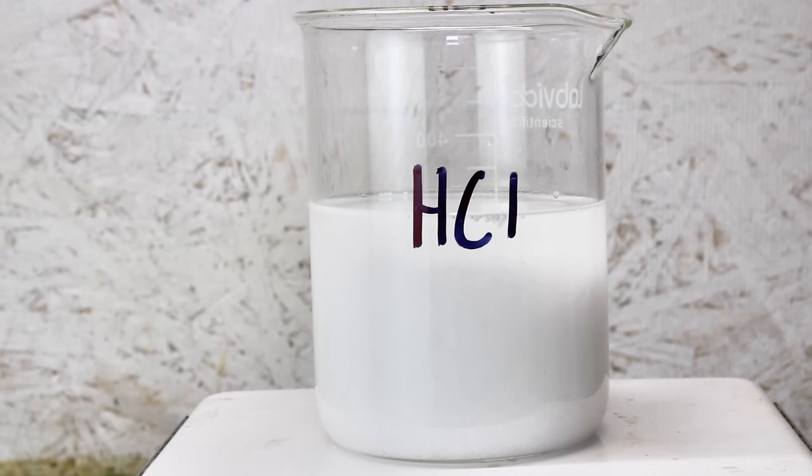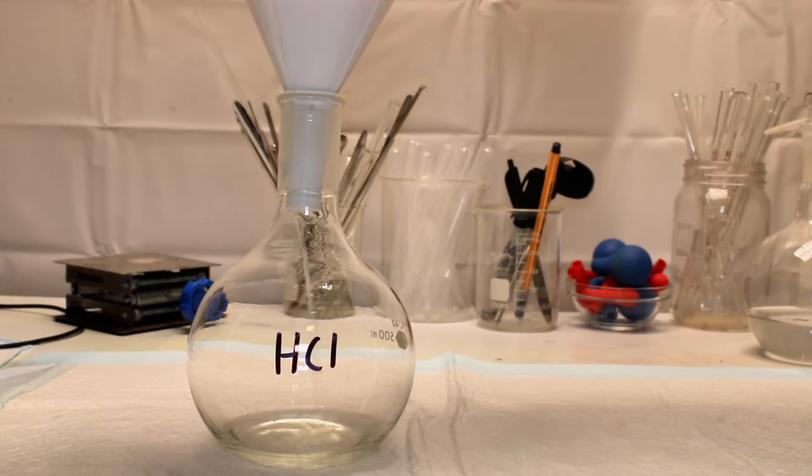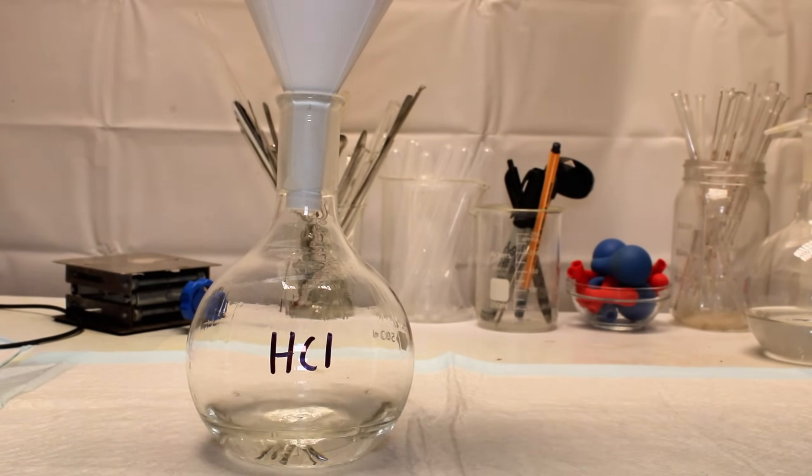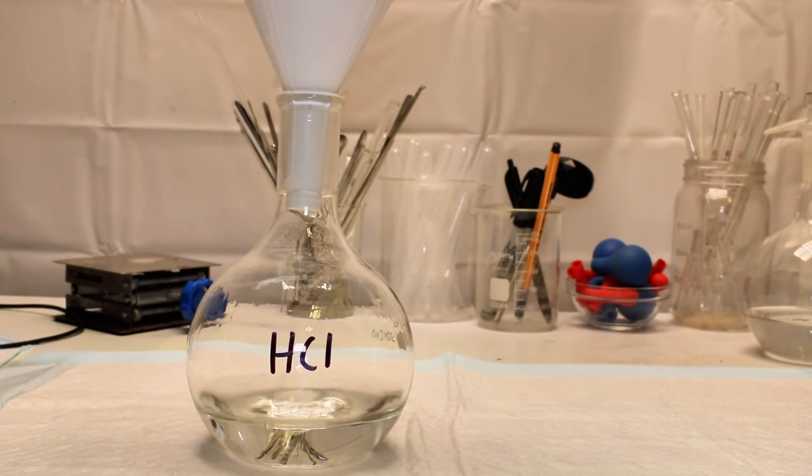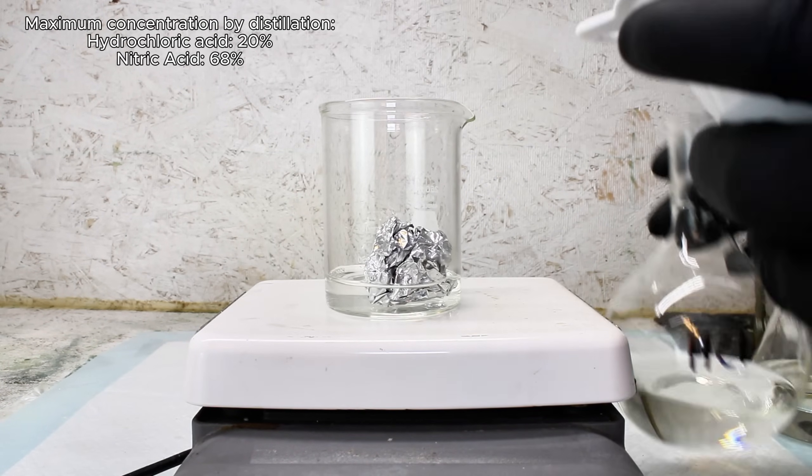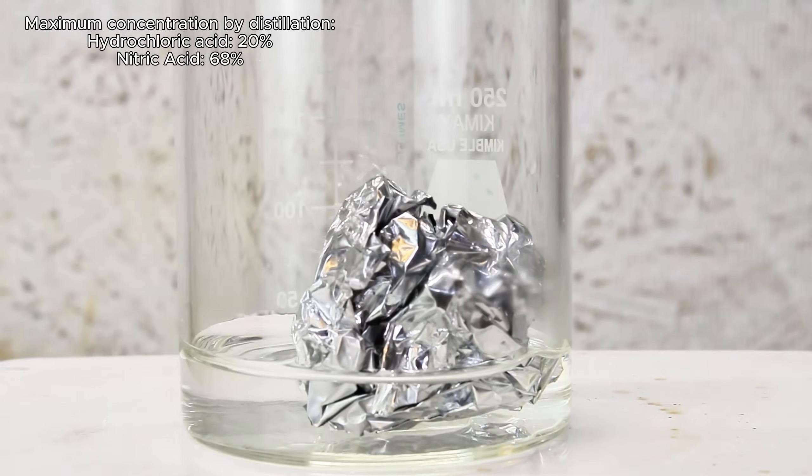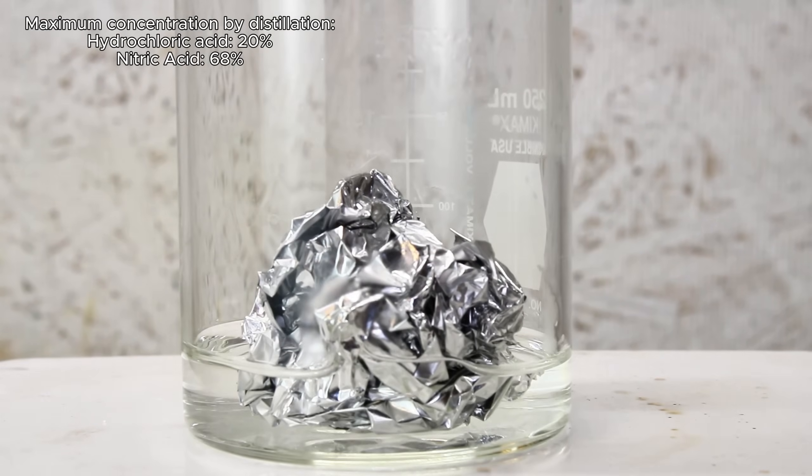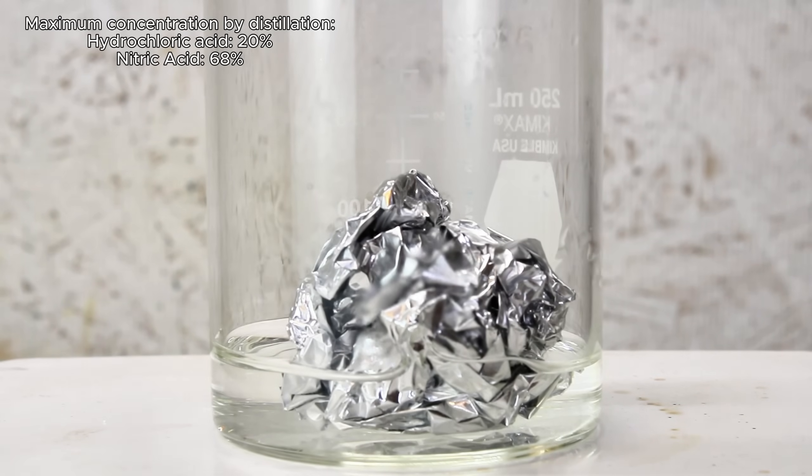That said, making acids by a double displacement like this is possible, but not ideal. Technically, the weak hydrochloric acid here can be boiled down or distilled to a maximum concentration of 20%, and the same goes for the very weak nitric acid to a maximum of 68%, but at this point, that method really isn't the easy one anymore.